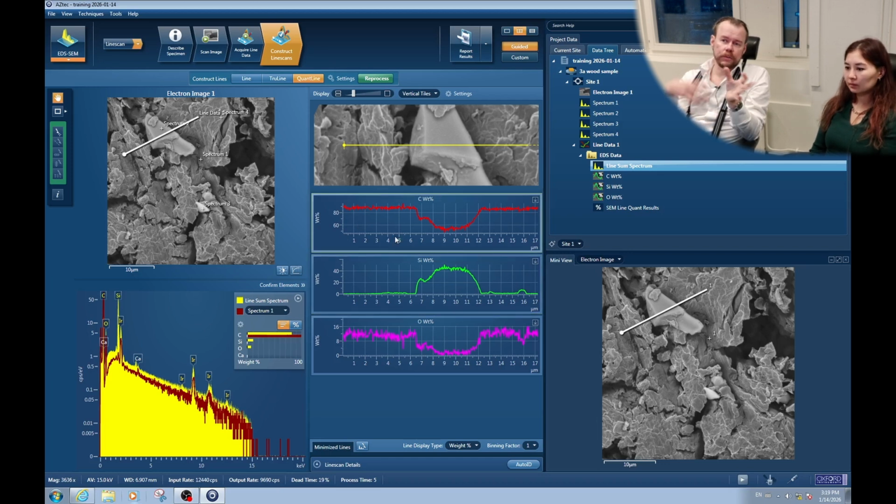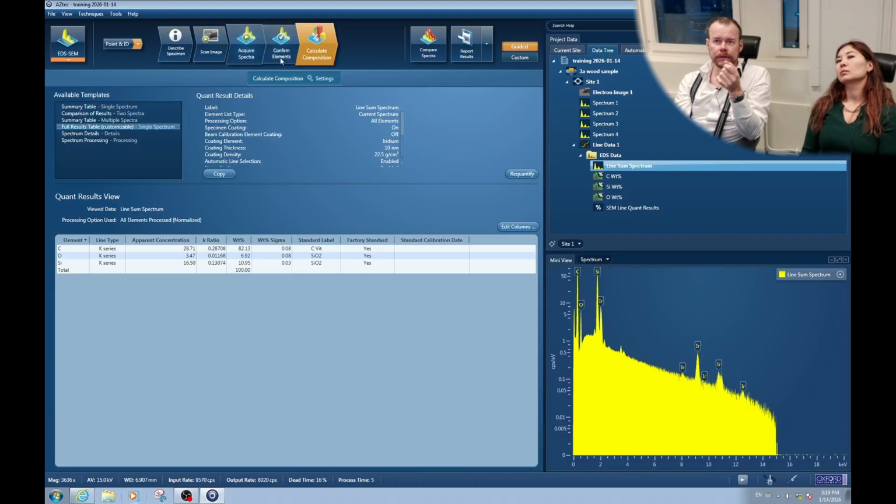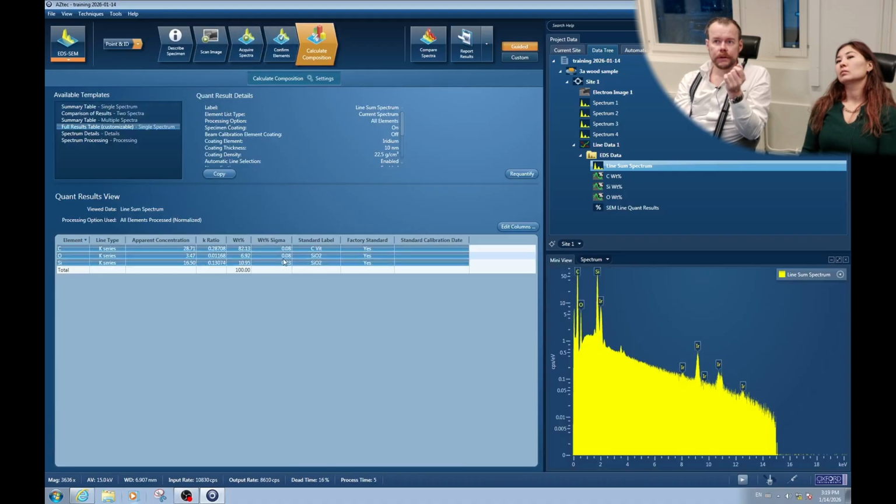So I usually copy these images separately into a Word document and bring all that with me. And if you want to have the data table that we had on this point scan here, then you can just mark and copy and grab that with you.